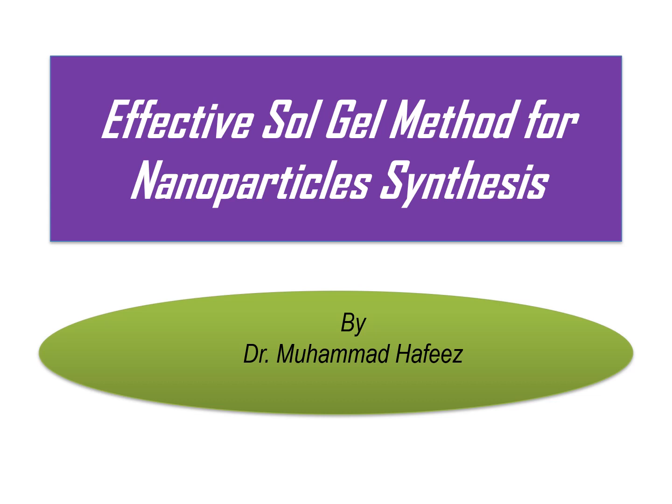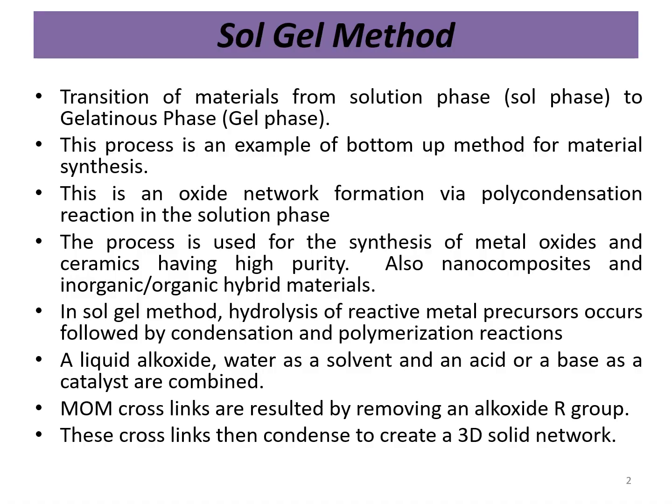Hi everybody, today we are going to discuss the effective sol gel method for nanoparticle synthesis. Basically, this method is the transition of materials from the solution phase, commonly called the sol phase, to the gelatinous phase, commonly known as the gel phase.